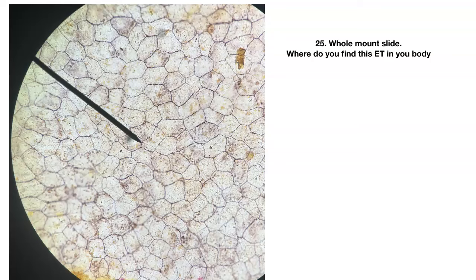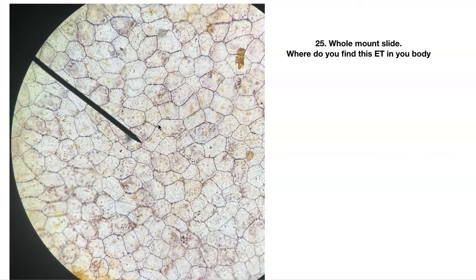Number twenty-five — whole-mount slide. This is simple squamous mesothelium. Where do you find it? This forms your serous membranes: visceral and parietal pleura around the lungs, visceral and parietal pericardium around your heart, and visceral and parietal peritoneum in your abdominal cavity.